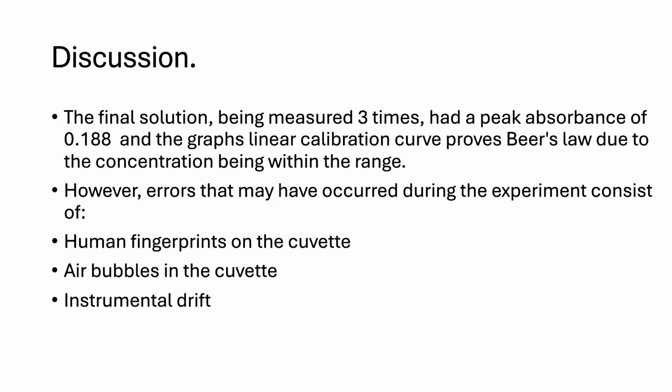And these 3 can cause it because human fingerprints will interfere with the light, and the air bubbles will reflect the light back onto itself, and into a solution, which could cause peaks that are unneeded. And an instrumental drift could just mean there was too little or too much added into the cuvettes.